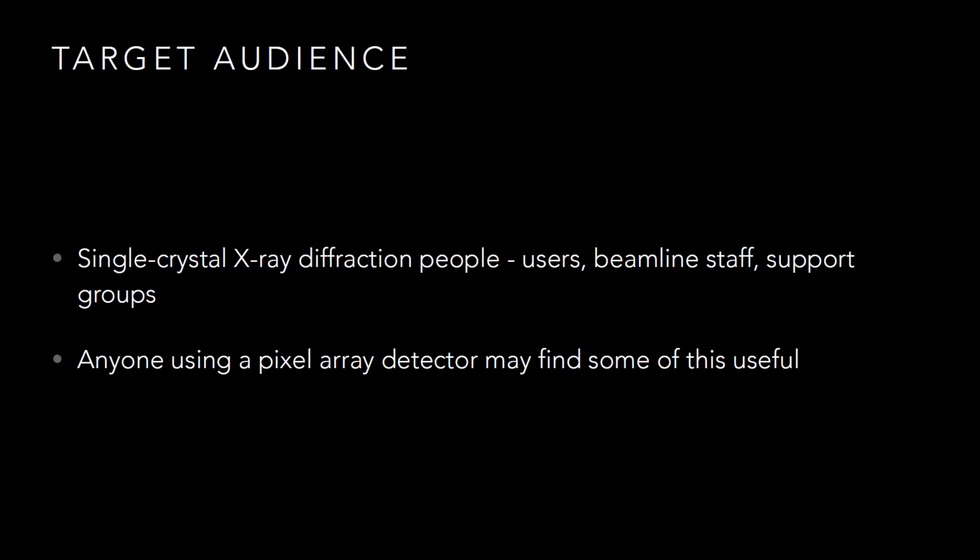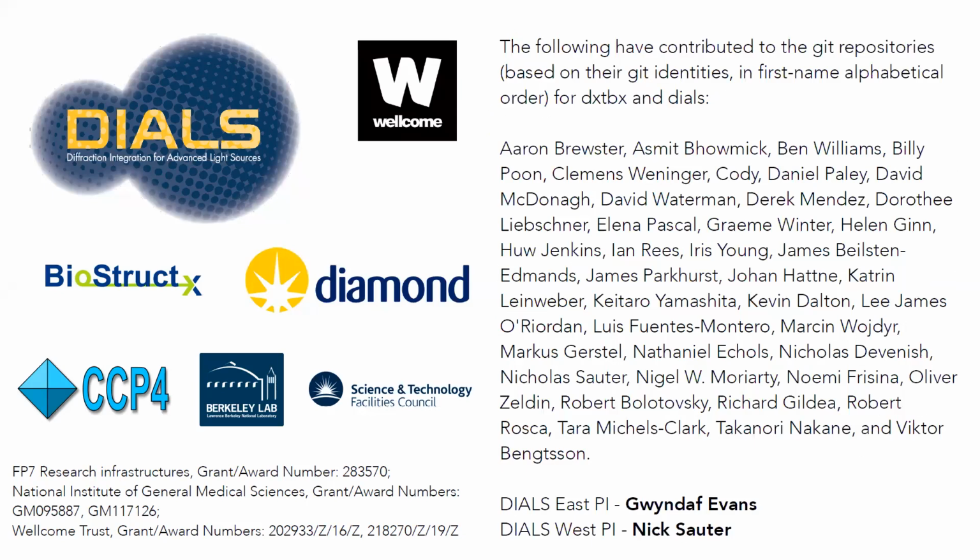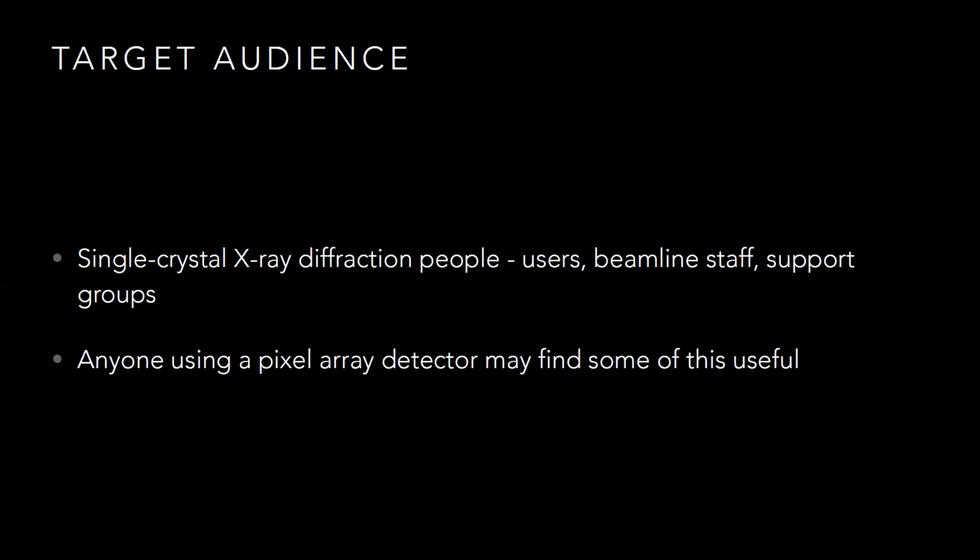Oh, the laser pointer advances the slides as well. Okay, good. And then also over the years, certainly in the world of single crystal X-ray diffraction, authors of software have been very kind in writing detailed papers on how their software works. And so that means that we start from very fertile ground rather than an empty field. Over the years also many people have contributed to the DIALS software. Here's a list which is probably out of date because people keep on adding software and so forth. So you can go and have a look at the GitHub and see who has contributed.